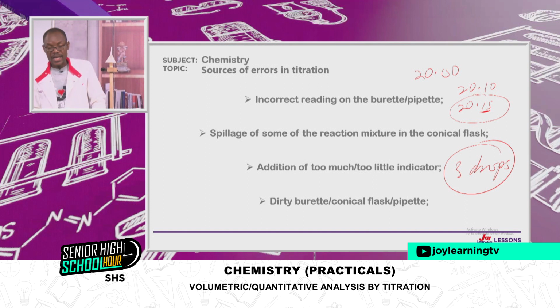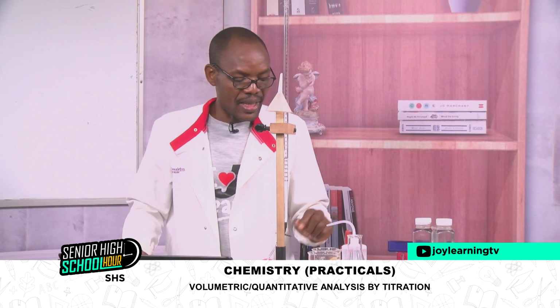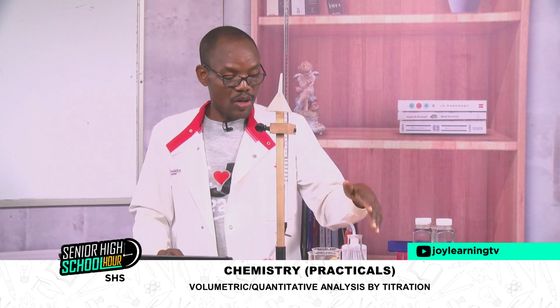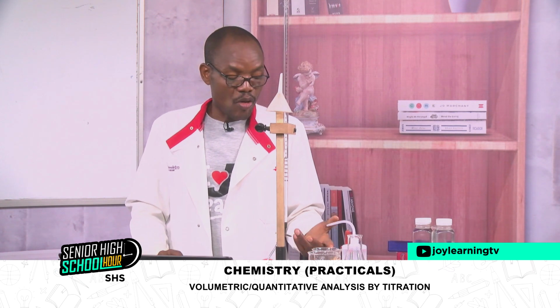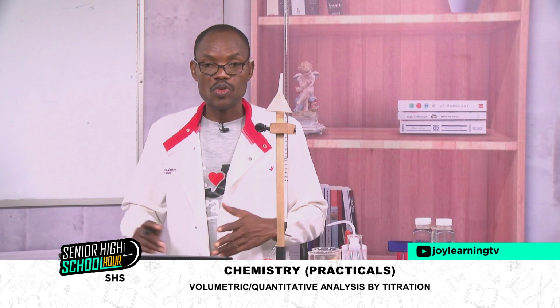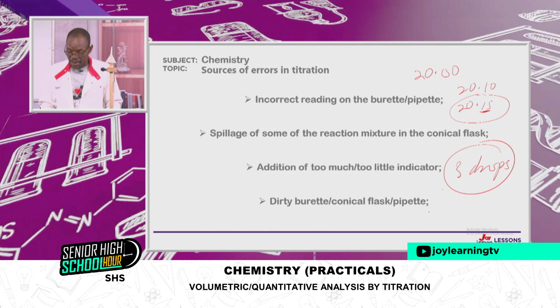Dirty burette or conical flask or pipette. These are volumetric wares that we use, and their design is for accuracy. So if you are using them dirty, they can interfere with your process. There could be contamination of the burette or the pipette or the conical flask or the beaker that is even containing the solutions. If that is the case, a reaction can occur that can cause the solution to either increase in concentration or decrease in concentration, and that will also affect your titration process. So always the burette, the conical flask, the pipette, and of course the beakers must always be clean.